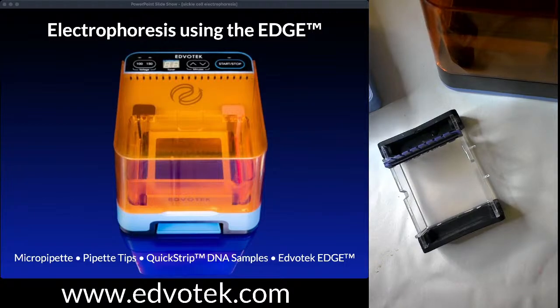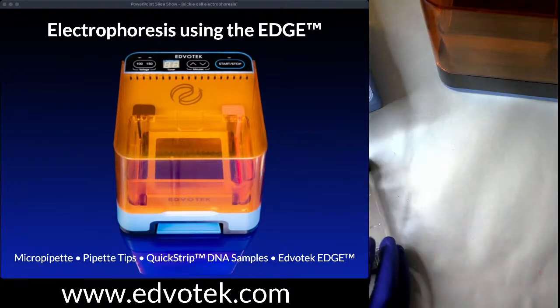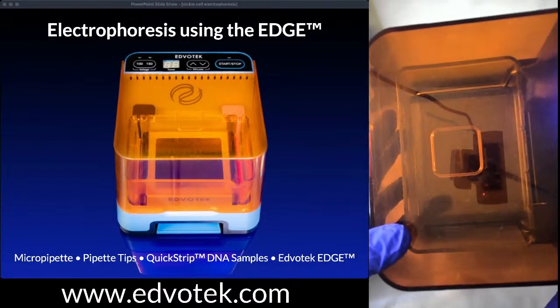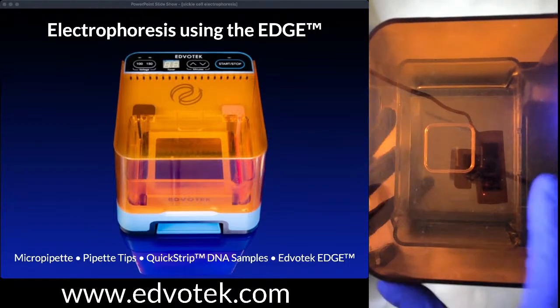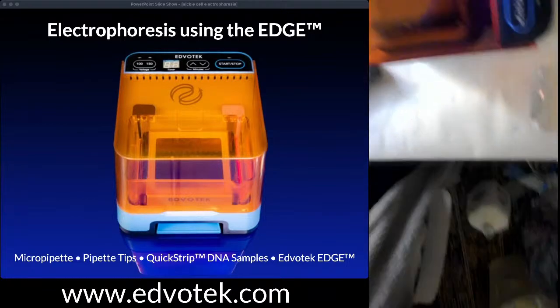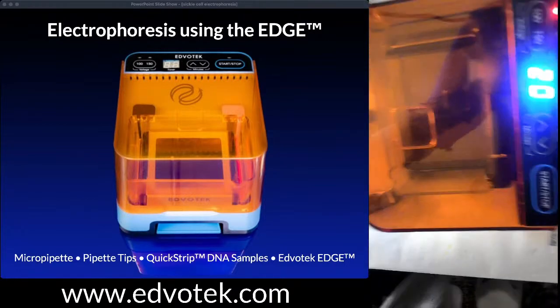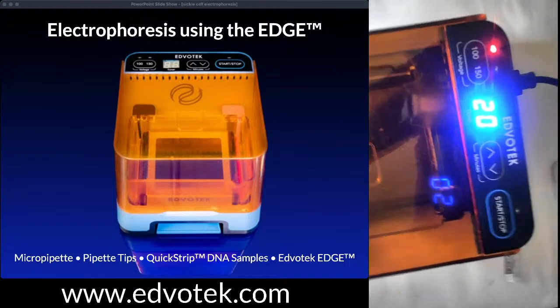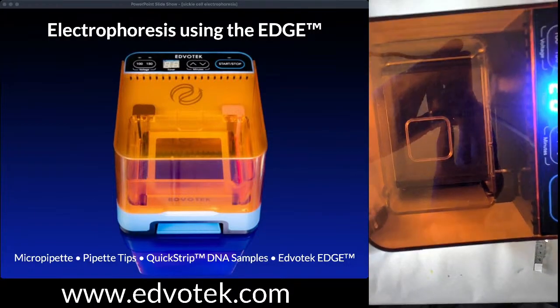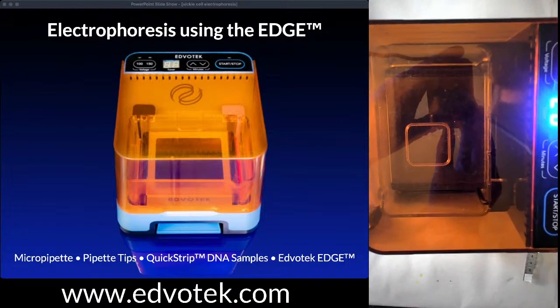So electrophoresis itself is super versatile. It can be used to separate a variety of different biomolecules: DNA, RNA, protein. Again, we're doing DNA today. We're doing it in our Edge. Let me pull up the camera a little bit. Oh, let's not look at my messy floor, but let's see more of the Edge. You can see there is our timer. Here is our orange filter.